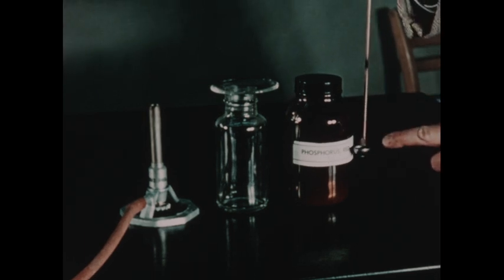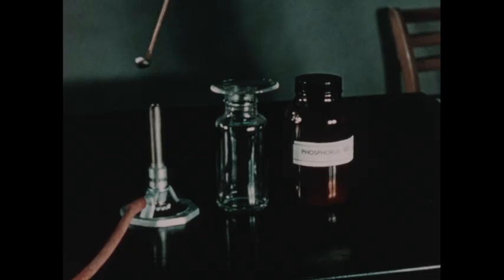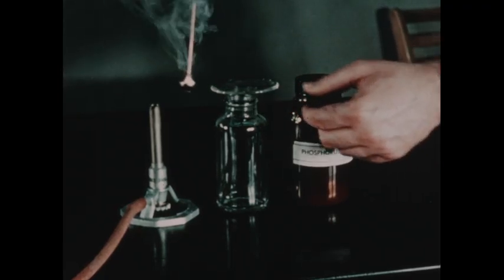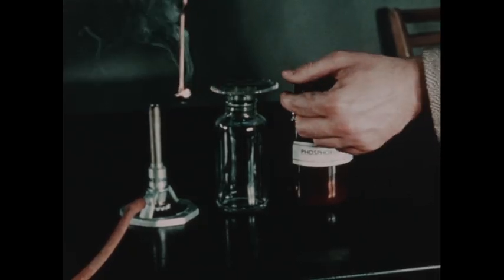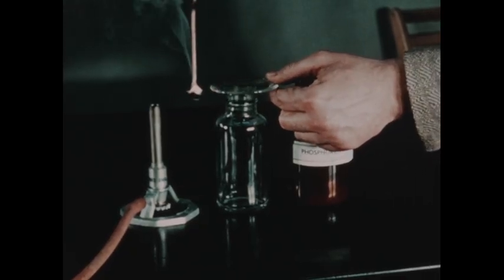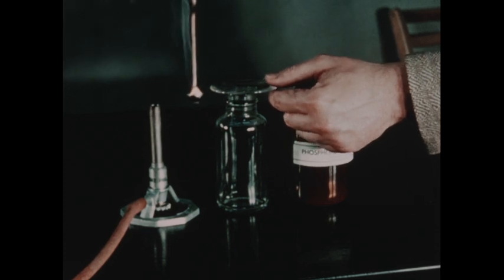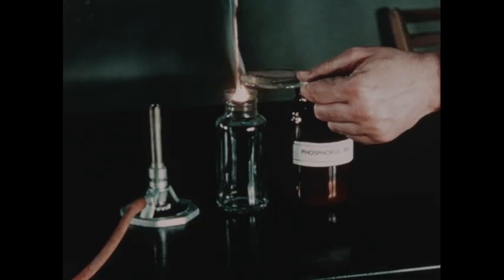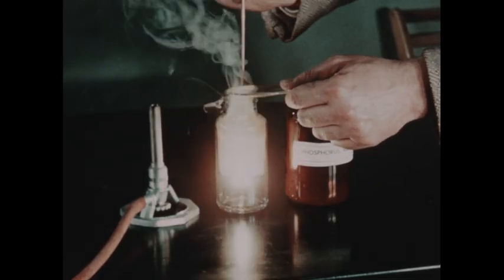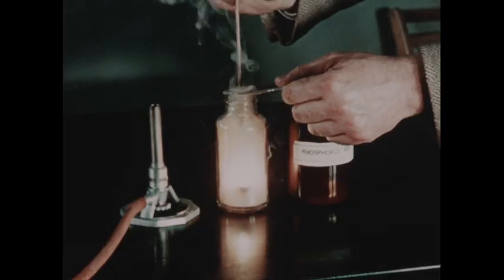I've placed some phosphorus from this bottle in the deflagrating spoon and we will ignite this now over the Bunsen burner. Notice the luminous white clouds of phosphorus pentoxide produced as the phosphorus burns. We'll now place the burning phosphorus in the nitric oxide. And you'll note that combustion is rapid, more rapid than in air.